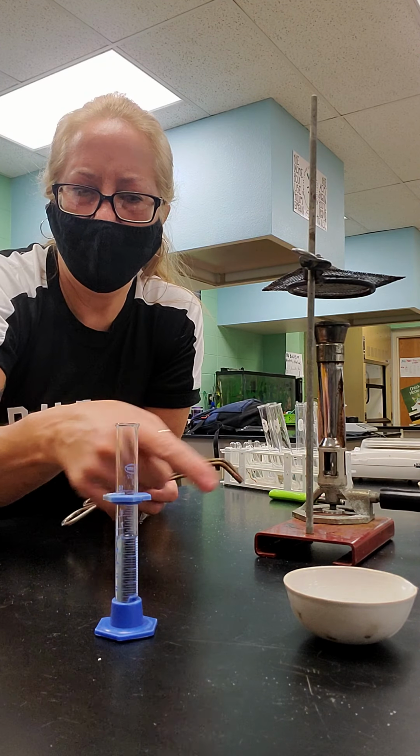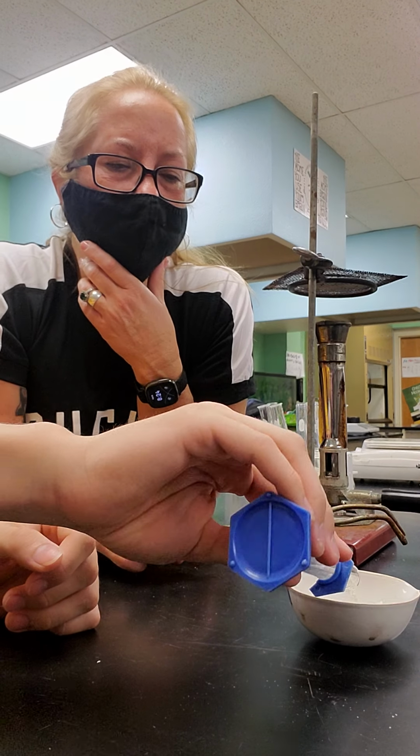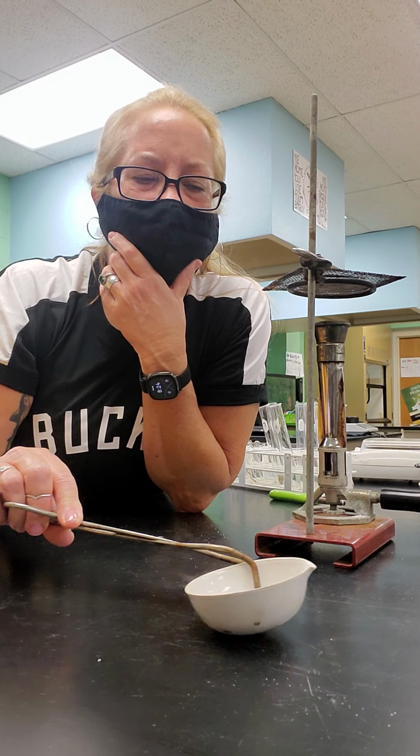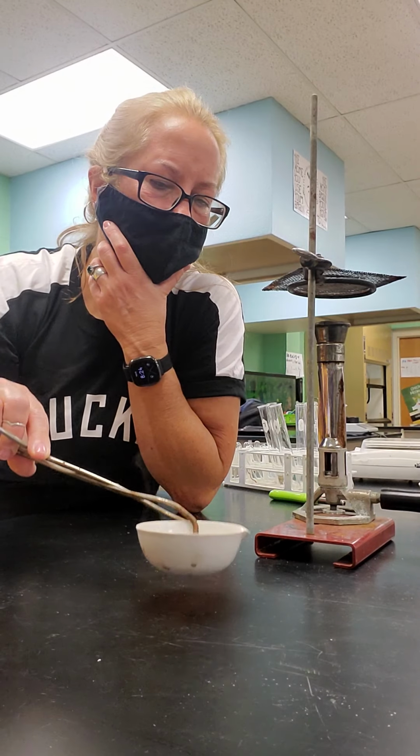Okay, add the water. So we're trying to see if it has the same properties as it had before. So did it just dissolve? Yes. Okay, so it just dissolved.